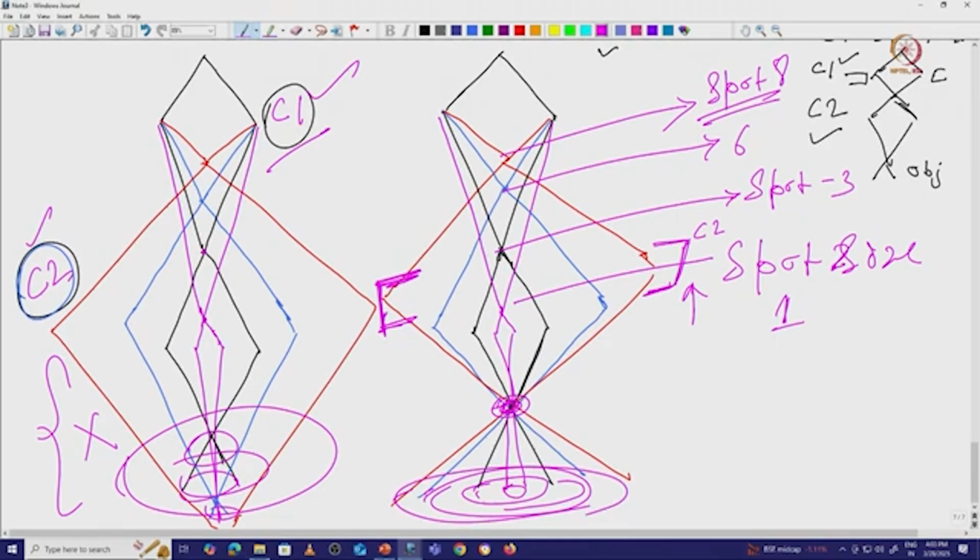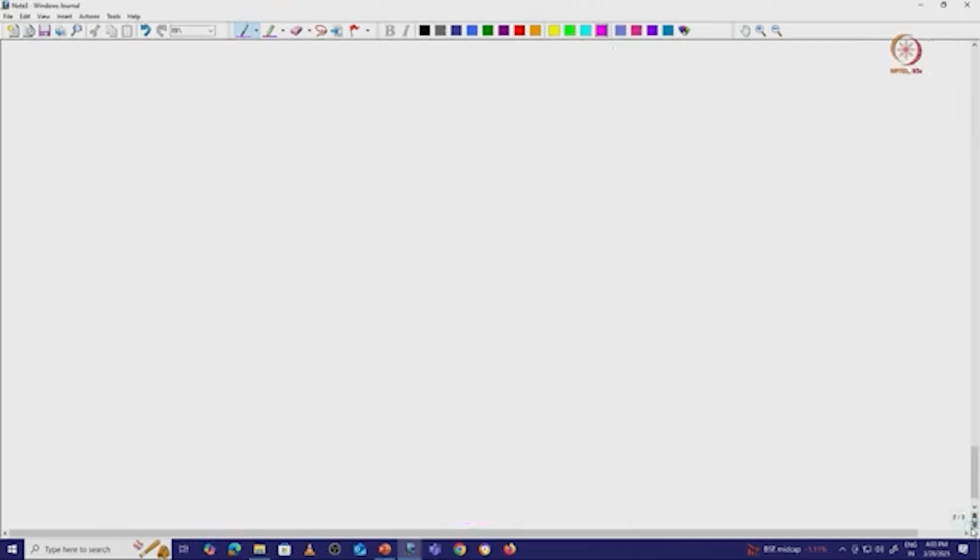Now, in the same setup, we use a high spot size and a certain intensity of magnetic field, and we get a particular electron beam. Now I am bringing the aperture into this picture, to see how it is going to behave.